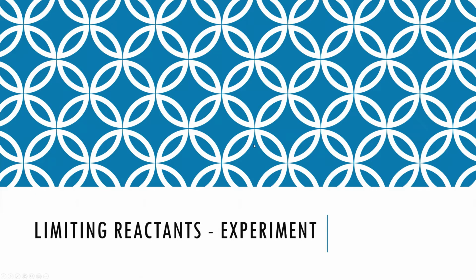In the experiment itself, you're going to be looking at determining these limiting reactants. You'll experimentally determine through a qualitative method what is the limiting reactant over a number of different reactions using different chemical tests. You'll also look at things quantitatively, determining how much of that limiting reactant is there and how much of the final product is generated, looking at the theoretical yield.